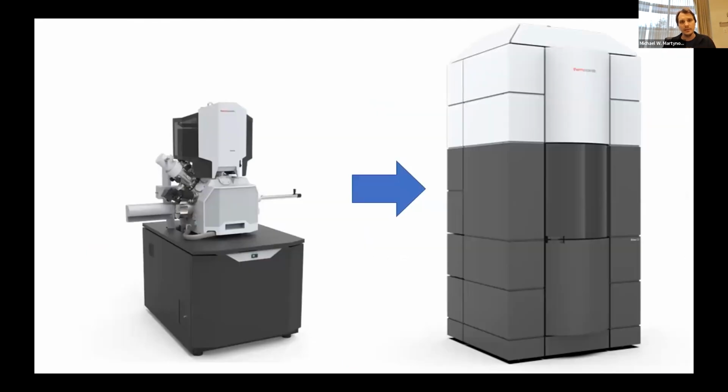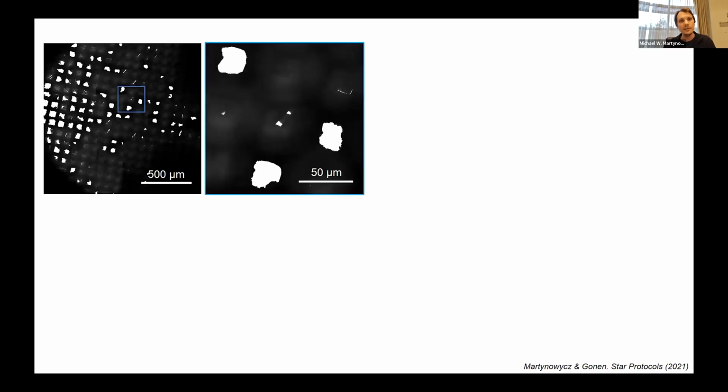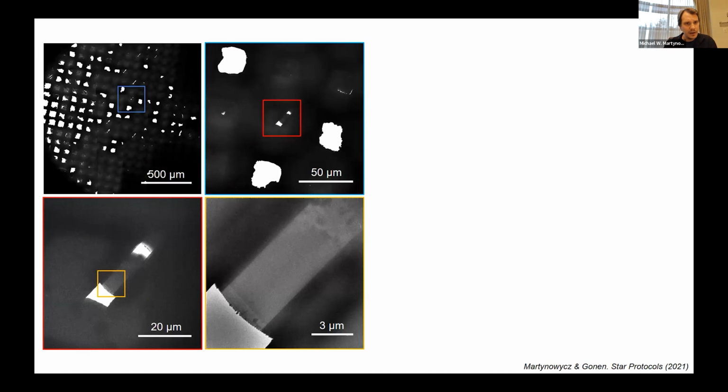We take this milled crystal and lamella, we load it into the TEM, and we can take pictures at multiple scales, where this is the entire grid, and we can CSI and zoom and enhance on different areas here and say, oh, what's that? And you can see our milled crystal and lamella as we keep zooming in on it. And there's our crystal and lamella, where you can actually demarcate the difference between the platinum layer around the crystals, the liquid surrounding the crystals, and the crystal and protein lamella itself here.